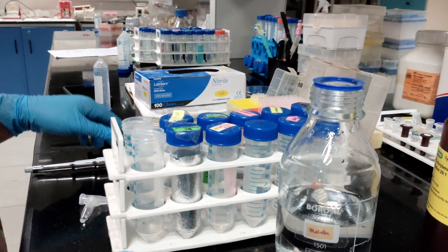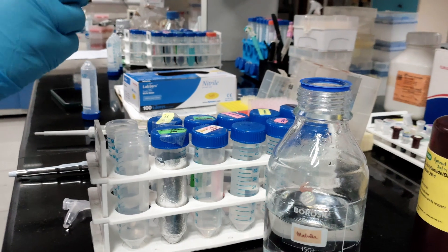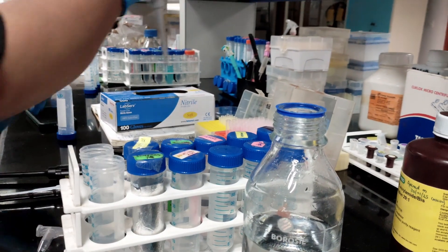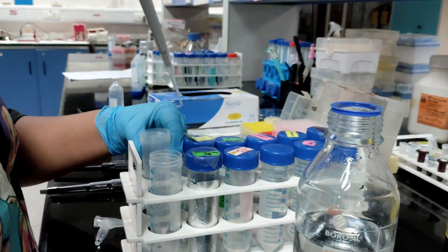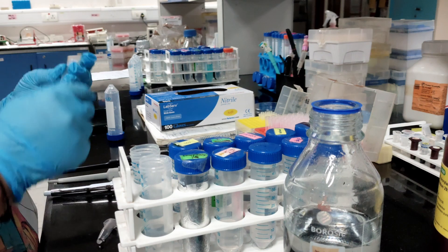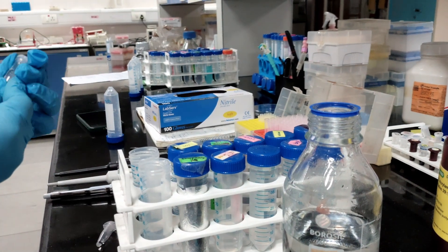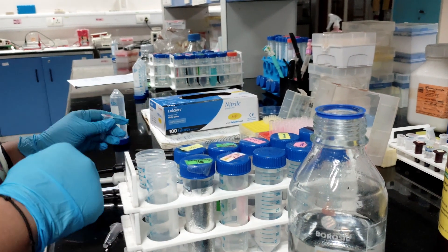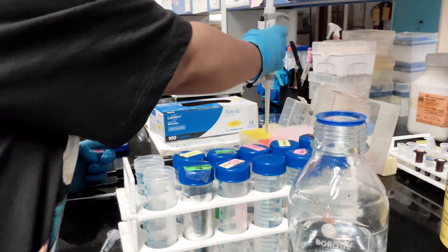The fourth component is 10% SDS. We'll add 100 microliters of 10% SDS for two gels. Next, we'll add 10% APS — just before adding, pour it in, and similarly add 100 microliters of APS.